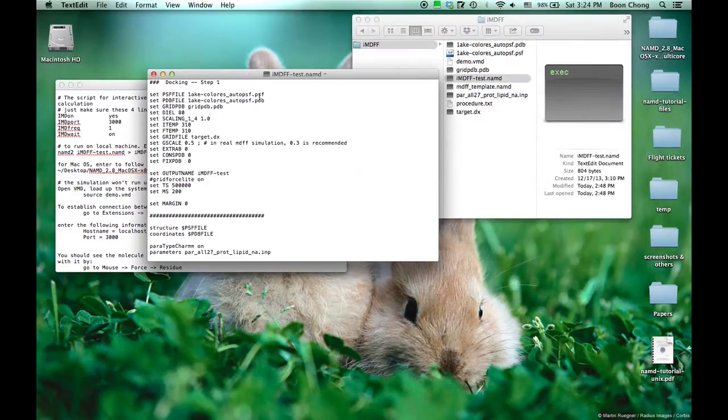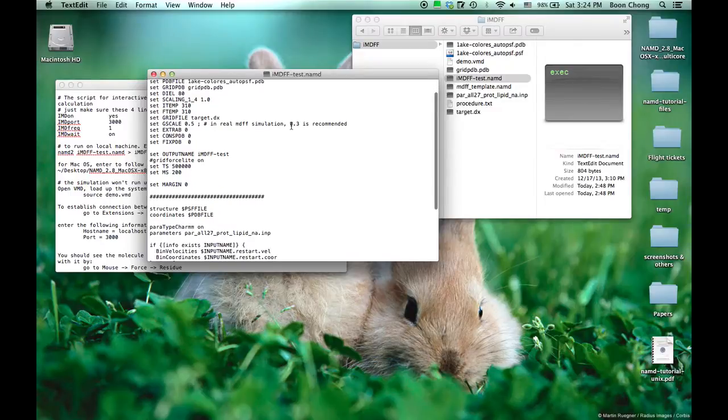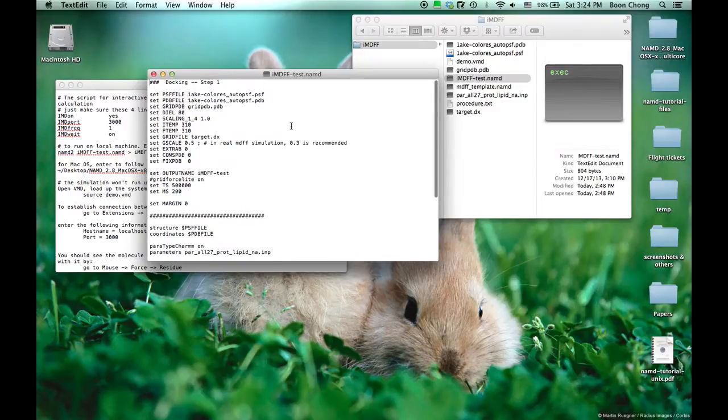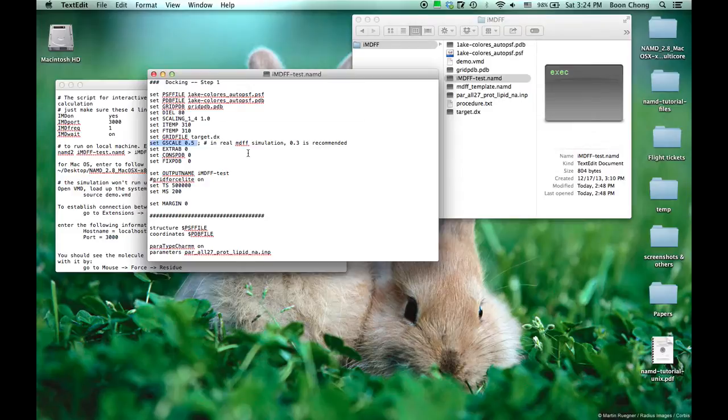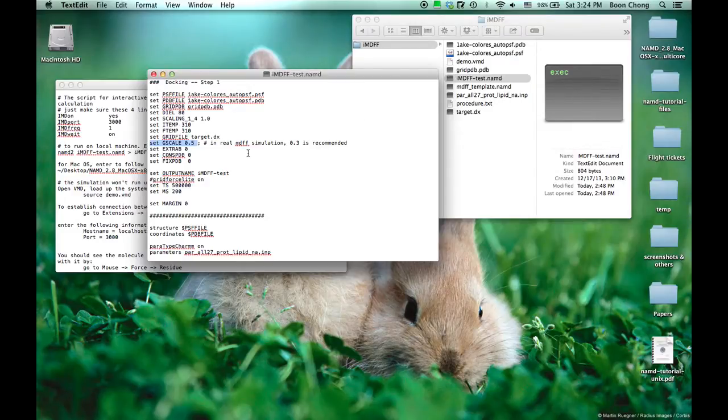You can see that it's kind of a standard script. One thing to notice is that the G scale, which is the coupling between the atomic model with the density map, is set to be 0.5. It's kind of big. In a real MDFF simulation, we recommend you to use 0.3.